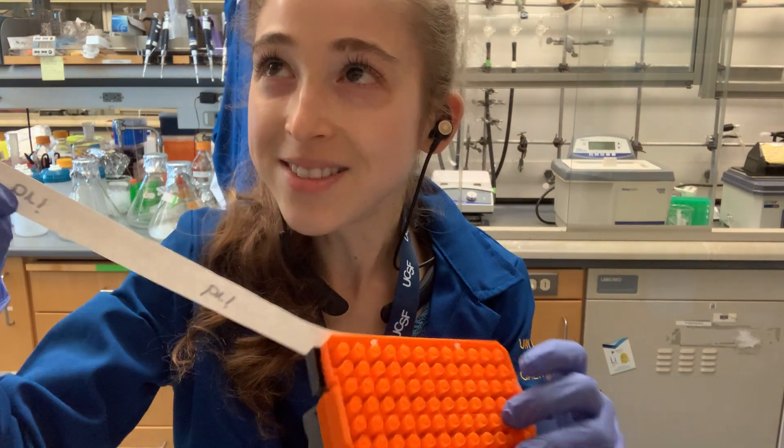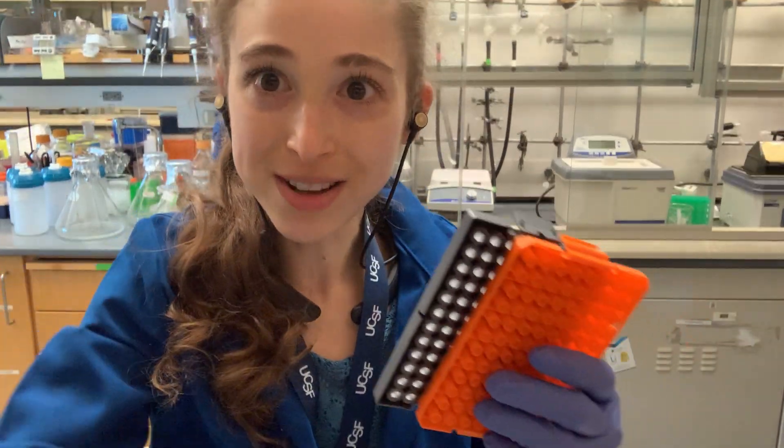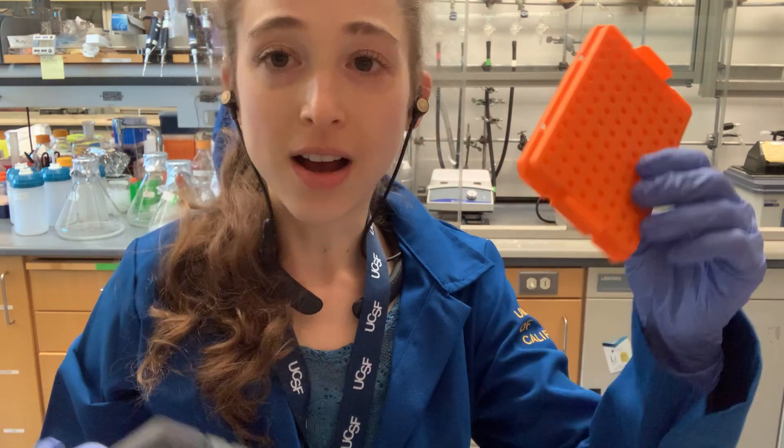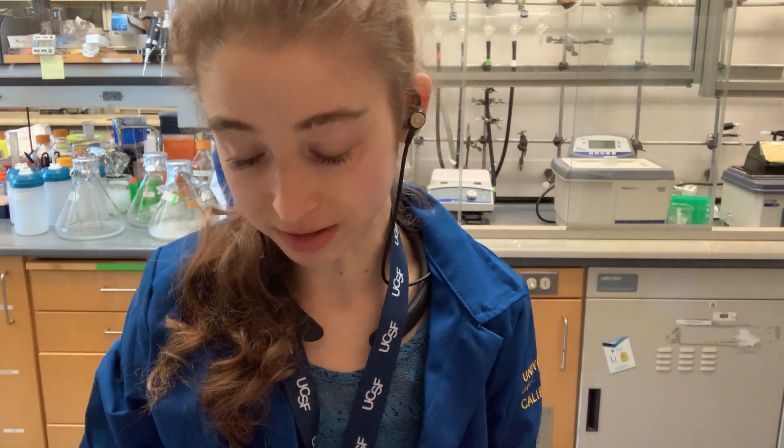In my new lab I didn't see anyone had these, which confused me — in my old lab I had a pile this high. The best size ones are the yellow tips, or any from a 20 or 200 microliter pipette.